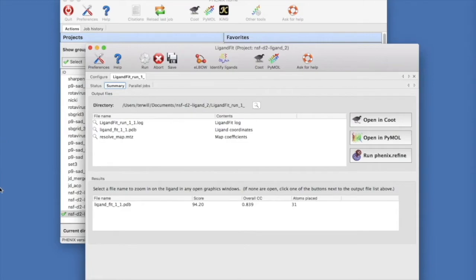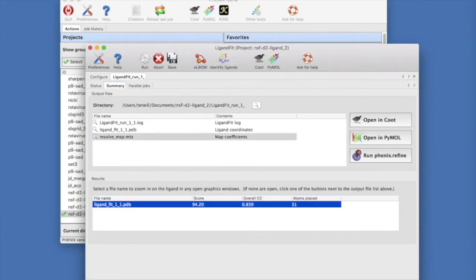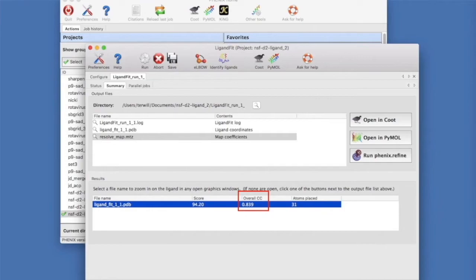Notice that one final solution is listed with an overall CC or map correlation of 0.84 and 31 of 31 atoms in the ligand placed in the map.